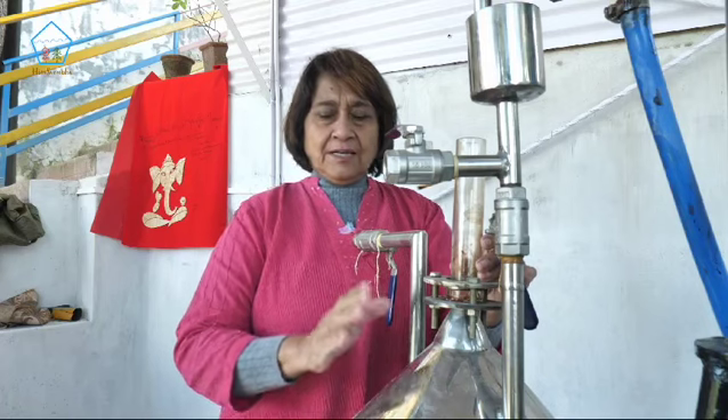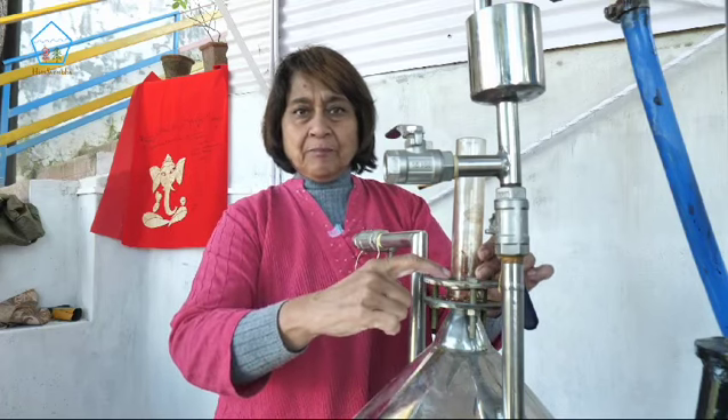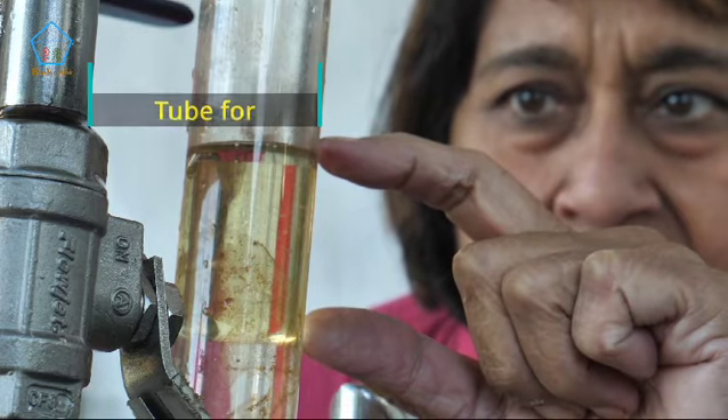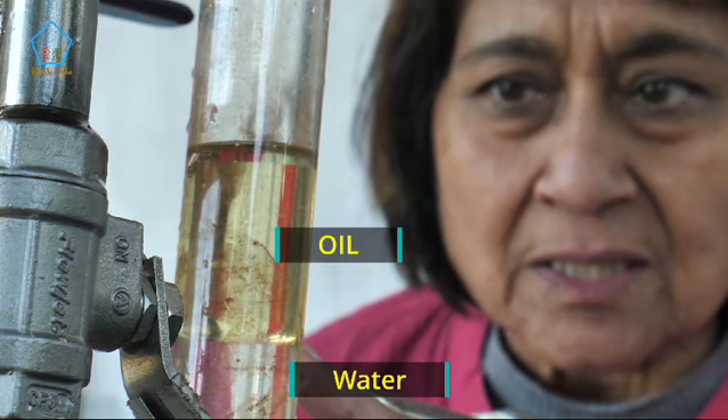The essential oil which is collected in this condenser will be visible in this tube here. Oil being less dense than water, it floats on the hydrosol here. You can see it in this tube.